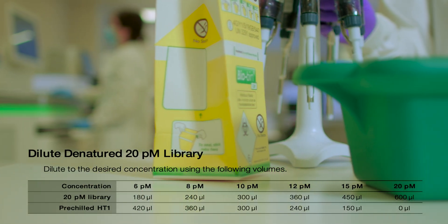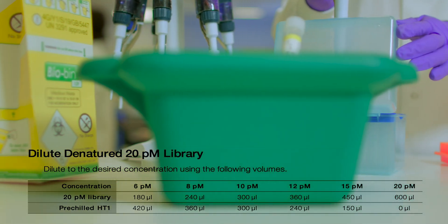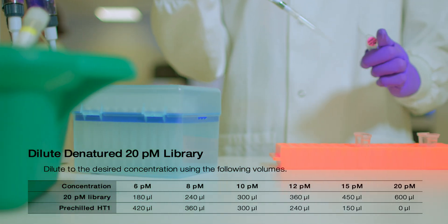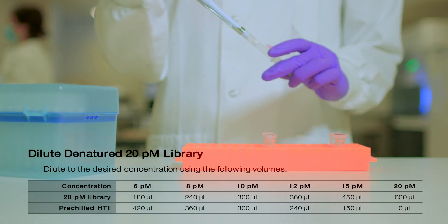At this point, you can further dilute the 20 picomolar library to the desired final loading concentration. In this video, we will assume a loading concentration of 20 picomolar. Therefore, no further dilution is needed.